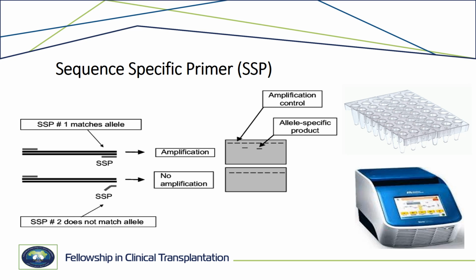So well number 1 could be in lane number 1. Well number 2 could be in lane number 2. Well number 3 could be in lane number 3. And you can see here that well number 3 is positive and well number 5 is positive, because it shows you 2 bands in lane 3 and lane 5. So from this pattern, we can identify the high resolution typing, and we will see more in the next slide.